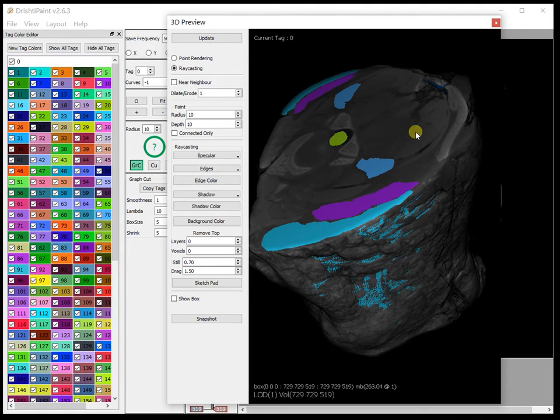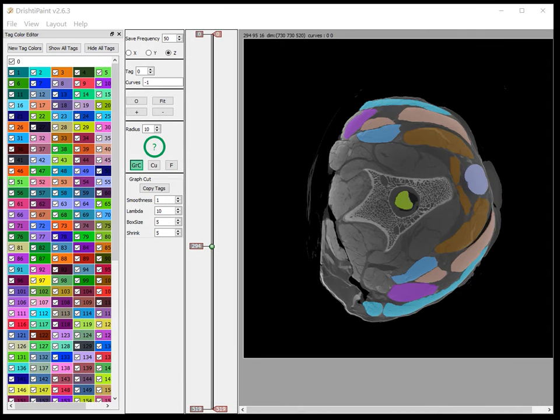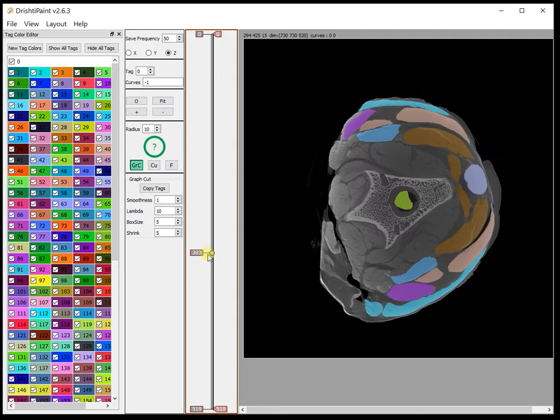Okay, so what we would like to do now is merge the two together, merge the tomographic data and the mask data. In order to do that, since we have only 8 bits, we would have to shrink the tomogram, and since our tag values range up to 145, 145 is the largest tag value that we have.